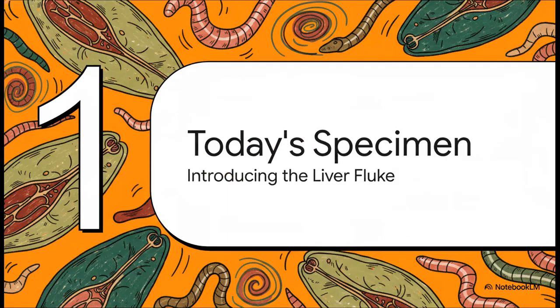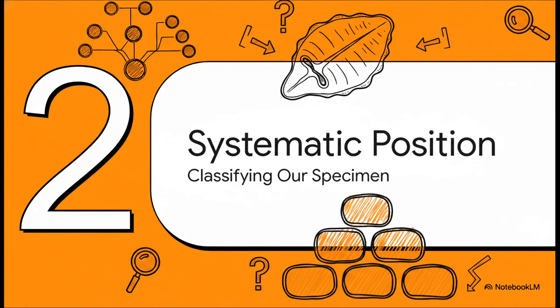Let's begin. All right, let's meet our specimen of the day, Fasciola gigantica. You might know it by its common name, the giant liver fluke. This organism is a type of flatworm, and it belongs to a class called Trematoda, a group made up entirely of parasitic worms. Now, before we start looking at the details, we have to do something really important. We have to classify it.